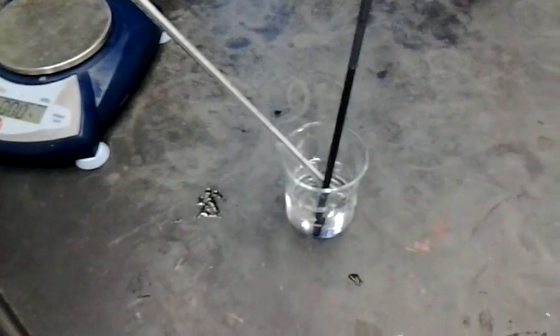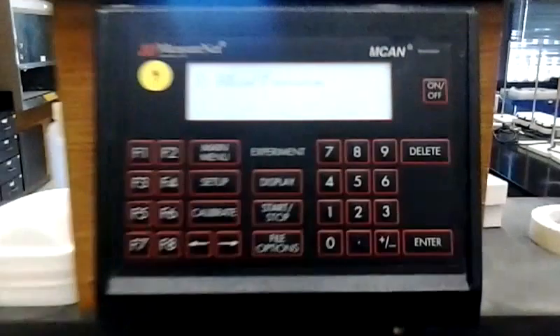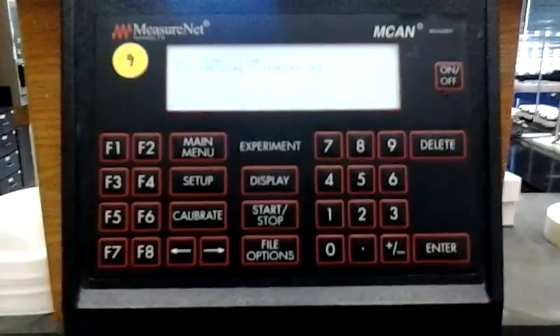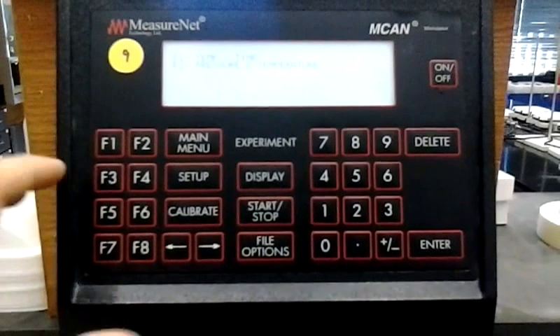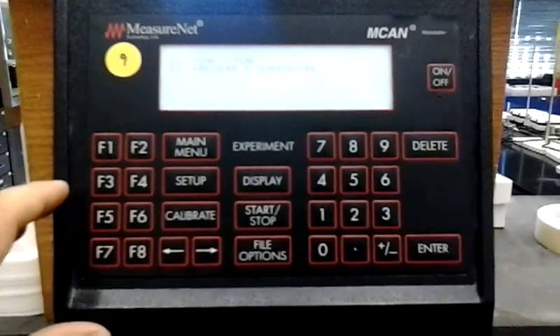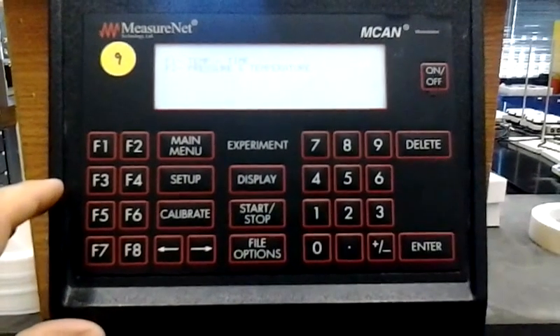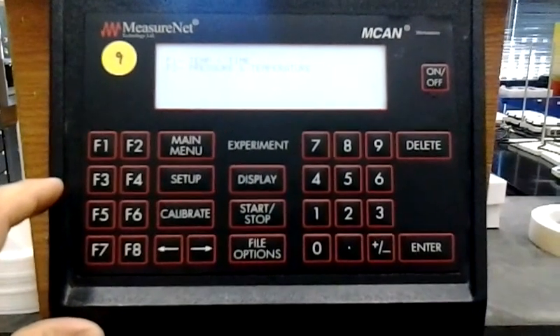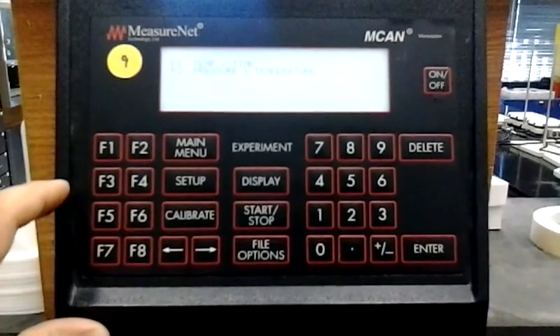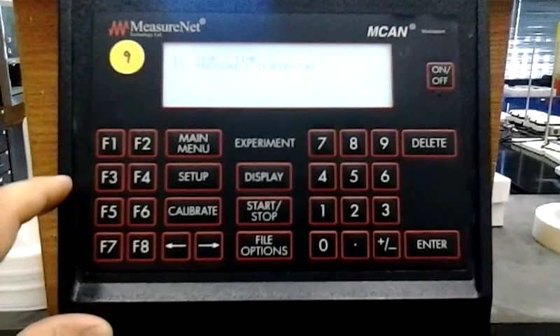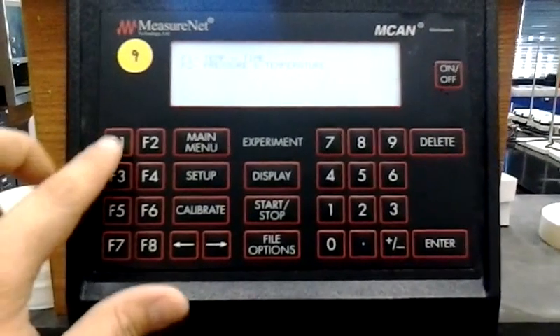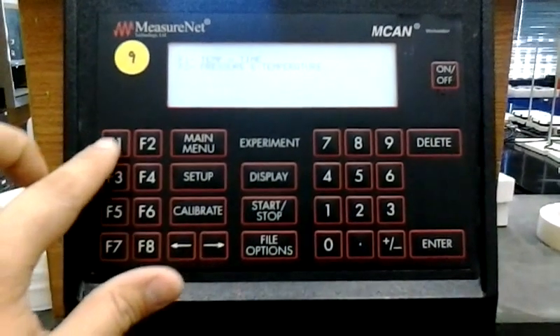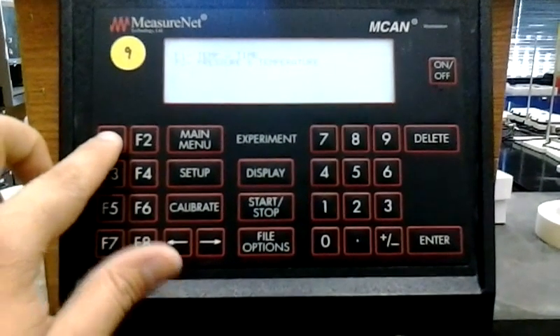So after two or three minutes, come back up to your MeasureNet station. What we want to do is you have two options with temperature. You have temperature versus time and pressure versus temperature. So we're going to select F1, which is temperature versus time.